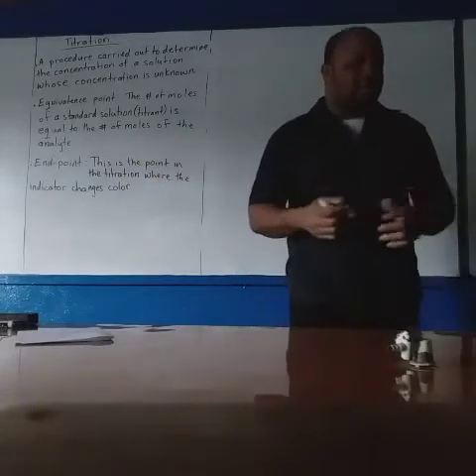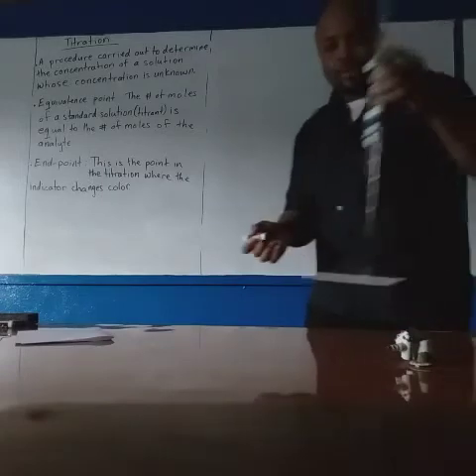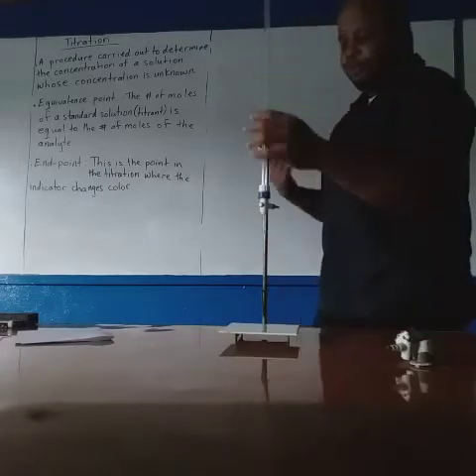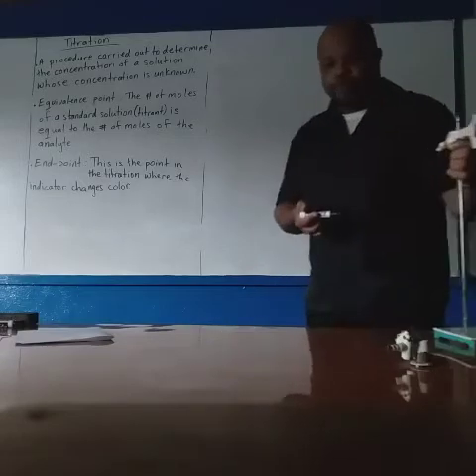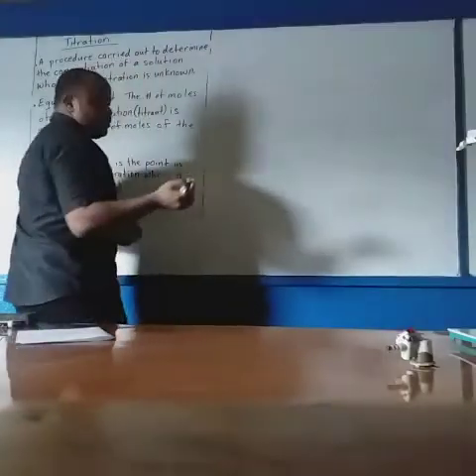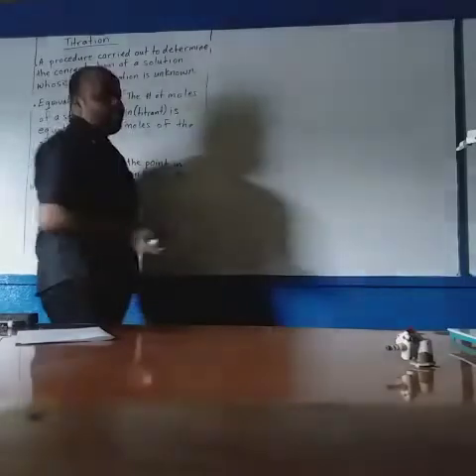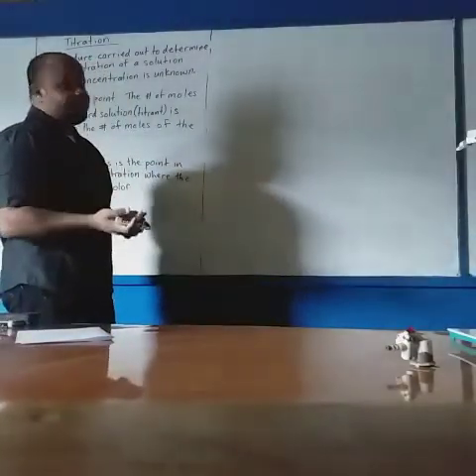So when we do a titration, right? Let's say we had filled the burette. So as I said, the burette can hold a maximum of 50. So let's work out a scenario here. And the scenario is, let's say you are provided with a solution of sulfuric acid.